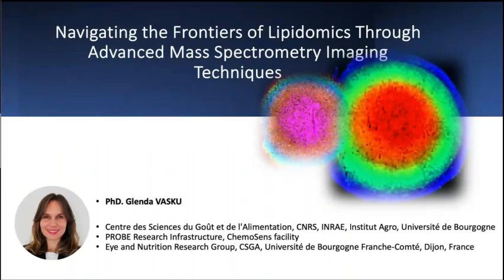I am very pleased and honored to present today one part of my PhD studies. As you said, I recently graduated in 2023, and my main research area is lipidomics, especially untargeted lipidomics, mostly applied to imaging mass spectrometry, which I will be discussing today, covering some basic terms of imaging and a little bit of applications based on the data that I obtained during my PhD.